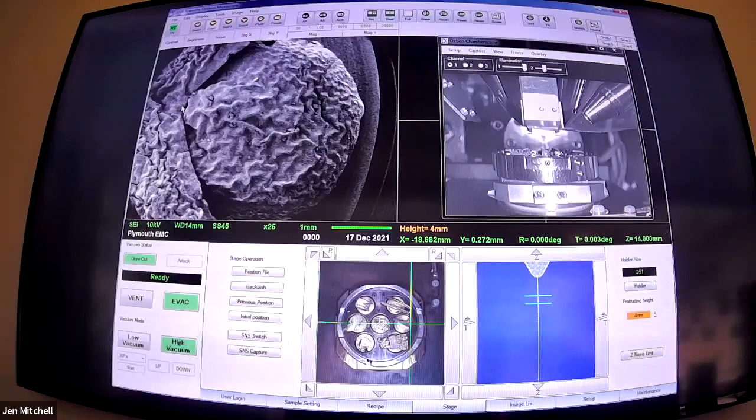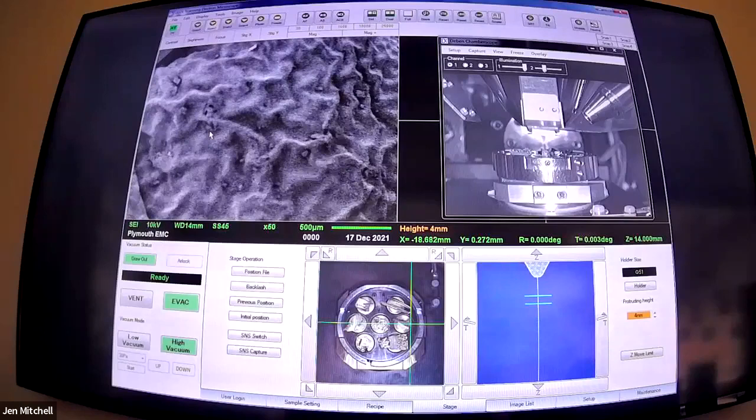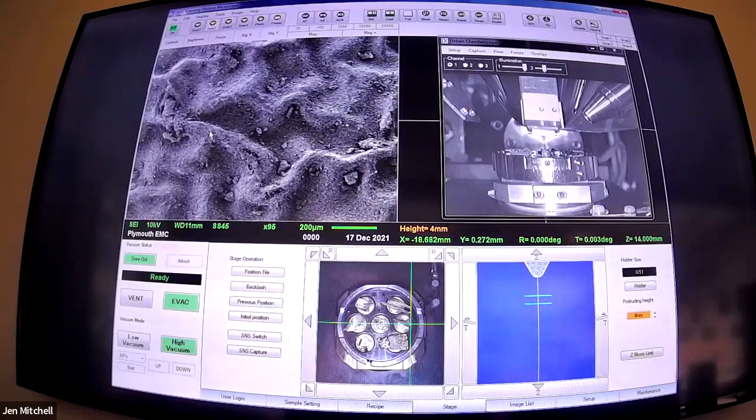It's part of the mulling spices. Tom very kindly cut this one in half for me, stuck it down, and then covered it in gold. It turns out really wrinkly, actually - quite upsettingly so. This one's stuck on with silver paint and gold, so it's double - extra festive. Very expensive bit of spice now. It turns out cloves are really, really wrinkly.